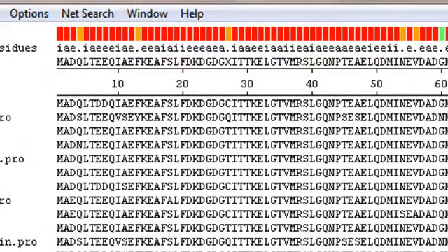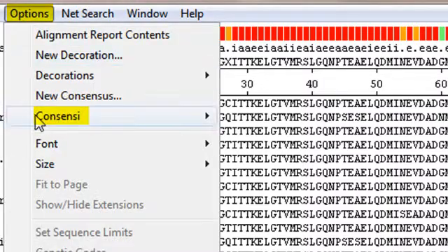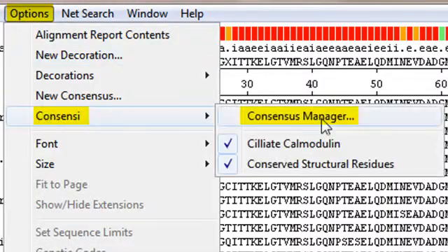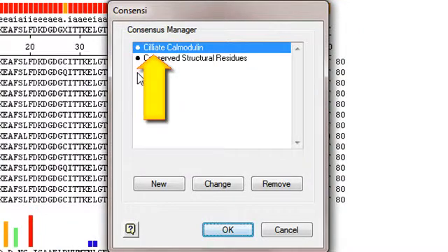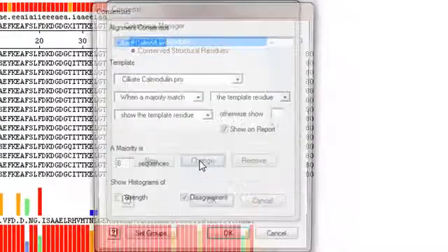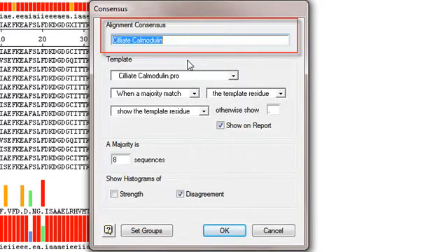To create a new consensus, or to edit or delete an existing consensus, I can use the command Options Consensus Manager. Here I'll select the first consensus I made and change it to compare all species to human calmodulin instead of ciliate calmodulin.